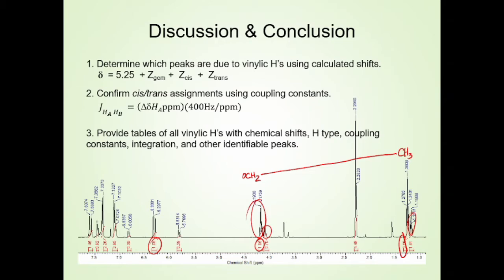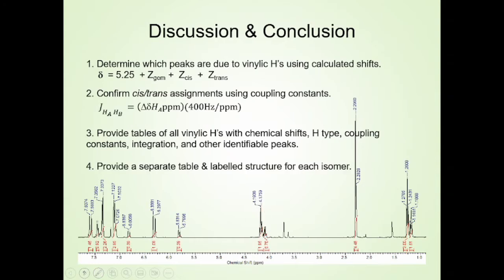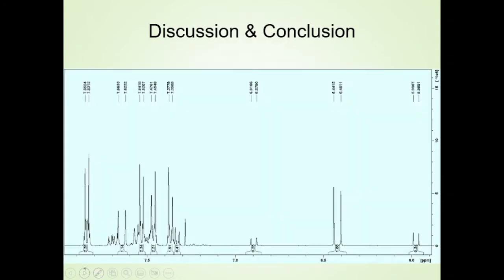Now, depending on your spectrum, you may get a spectrum that looks a lot like this, in which case, again, the other peaks that were down there, you'll probably be able to identify them, although maybe not. If you did not leave your sample on the rotary evaporator long enough, you may have hexane peaks that overlap your triplet for that ethoxy, in which case you may not see that. In particular, if you have a lot of noise in the aromatics, this one has aldehyde. I don't have the aldehyde peak out here, but that's out here as well.